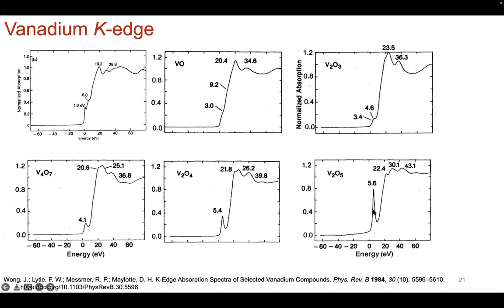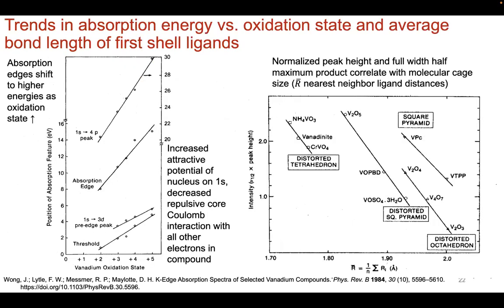Okay. So already just by looking at the XANES without fitting the X-ray absorption fine structure, you can already tell what kind of oxidation states you have. This is very useful if you're trying to understand how lithiation or sodiation or whatever intercalant you want to study, how these species affect the local structure. And you could do these type of X-ray absorption experiments to tell you that. Okay. So that's pretty powerful. This is probably one of the most beautiful papers on X-ray absorption, despite the plots looking like they are from 1984. Okay.